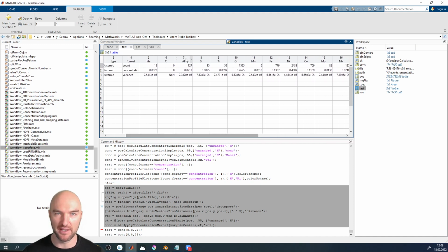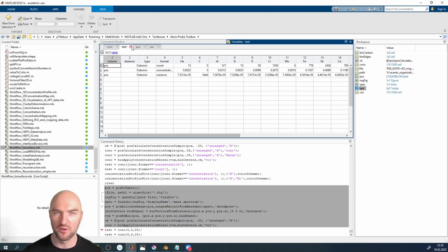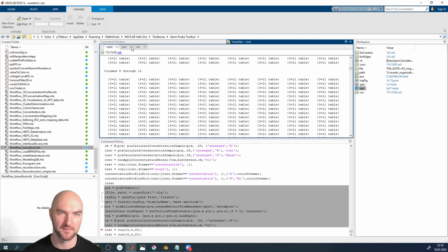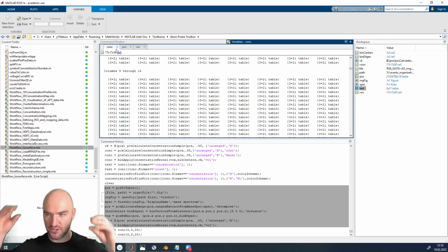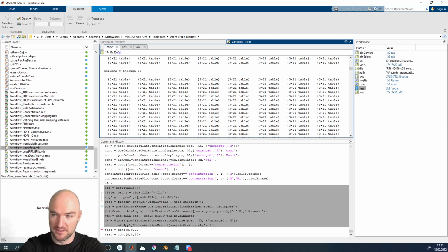But we get a concentration measurement, and the basis of that is about 2,000 nickel atoms, 1,500 chromium atoms, and we get the variance as well. The variance is still pretty low in this case, because the statistics are pretty okay. If I go into a voxel with very few atoms, then the variance statistics are probably not all that great. And of course, with voxelizations, if you shrink your voxels to very small, maybe 1 nanometer voxels, your variance might become pretty bad.